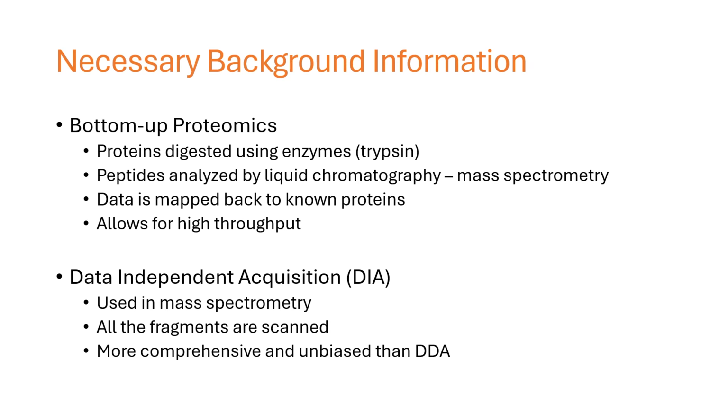It's also helpful to understand data independent acquisition, or DIA. It's a technique used in mass spectrometry. All the fragments are scanned in this technique versus data-dependent acquisition, DDA, where they cherry pick. They just find the most expressive proteins and image those.